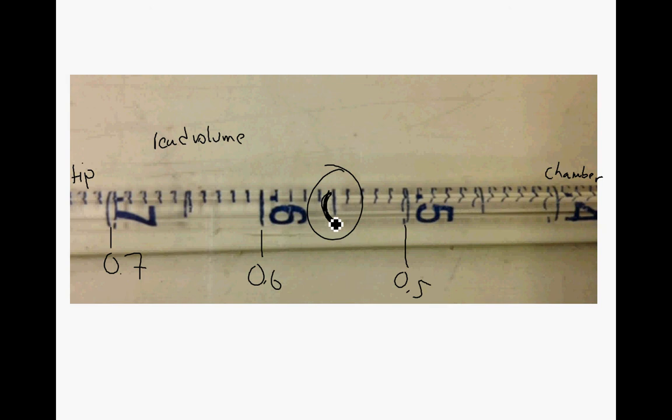Of oxygen. So where is this, right? This side is air, primarily O2, and this side is water here. This volume is between 0.6 and 0.5. So this is going to be 0.51, 0.52, 0.53, 0.54, 0.55, 0.56. So you would read this as 0.56 milliliters.